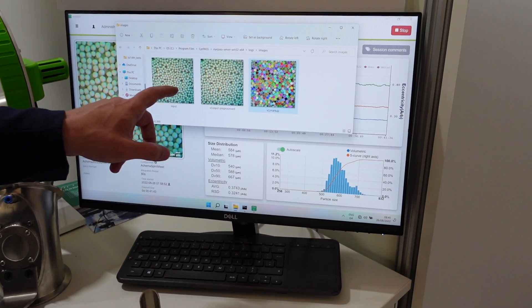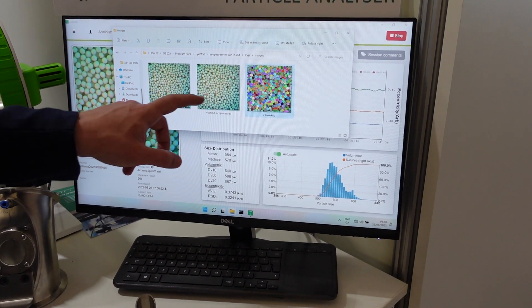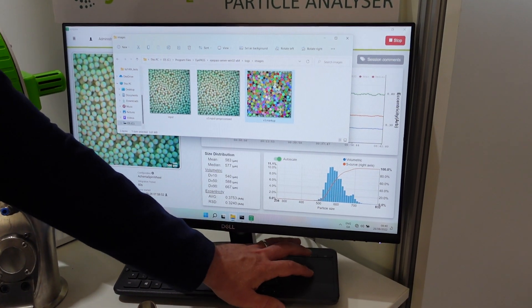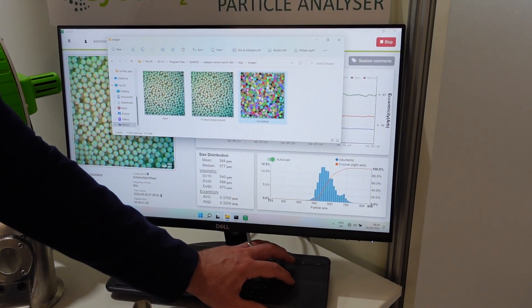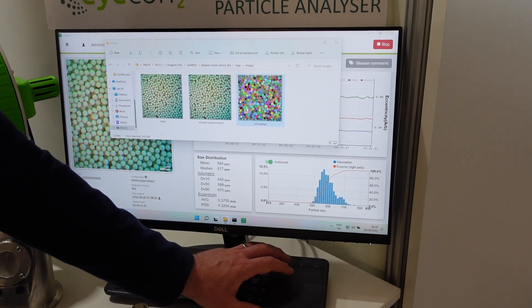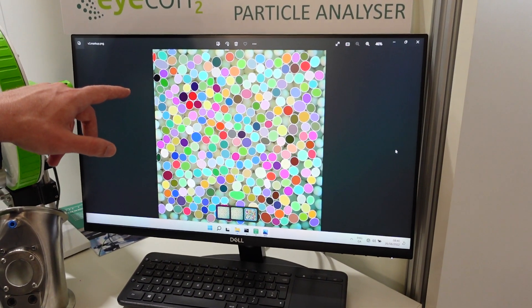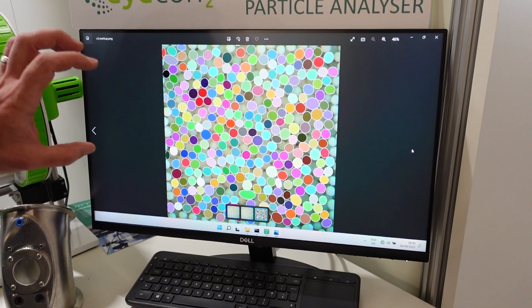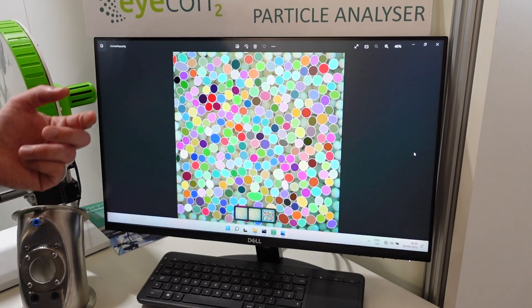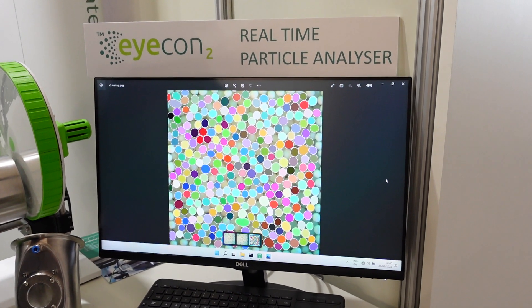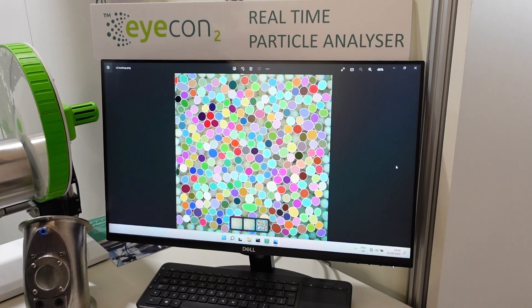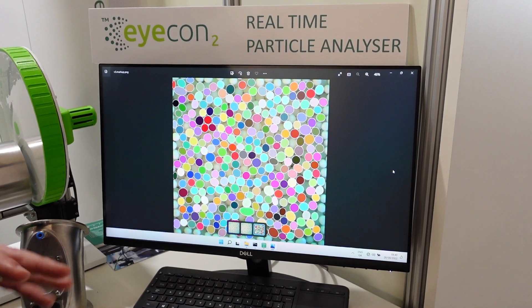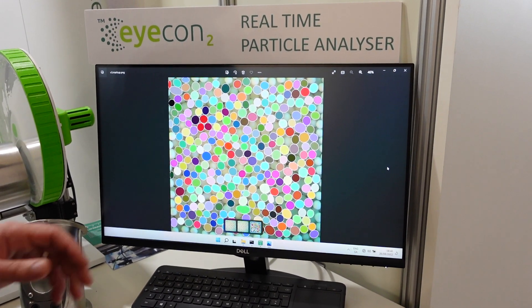Behind the scenes of our image analysis, we can see the images being reported back and then we get a breakdown image showing the mask of the thresholds that are being successfully matched for particle size. The different colors are the masks being overlaid on the materials, and then an equivalent ellipse has been fitted for its major and minor axis so we can project the volume measurement — all done in the back end in real time.